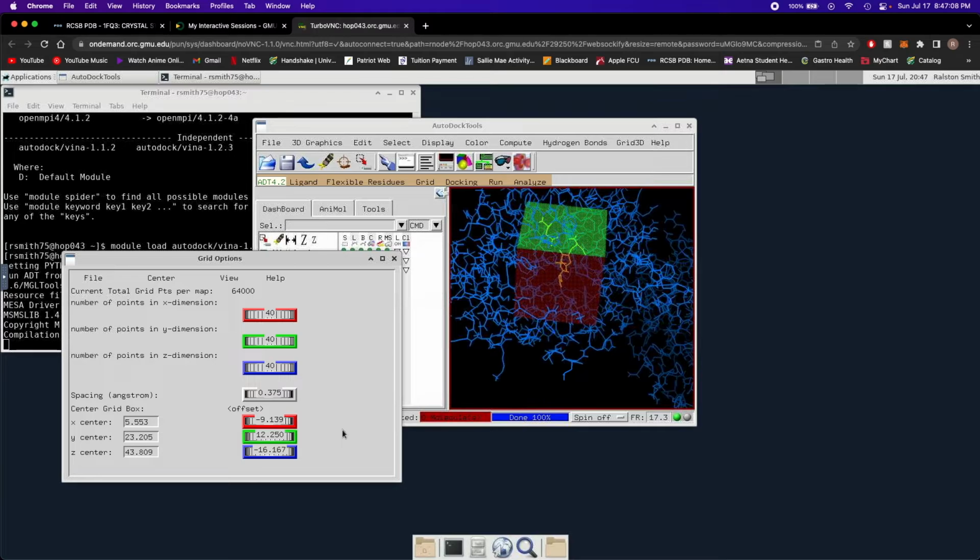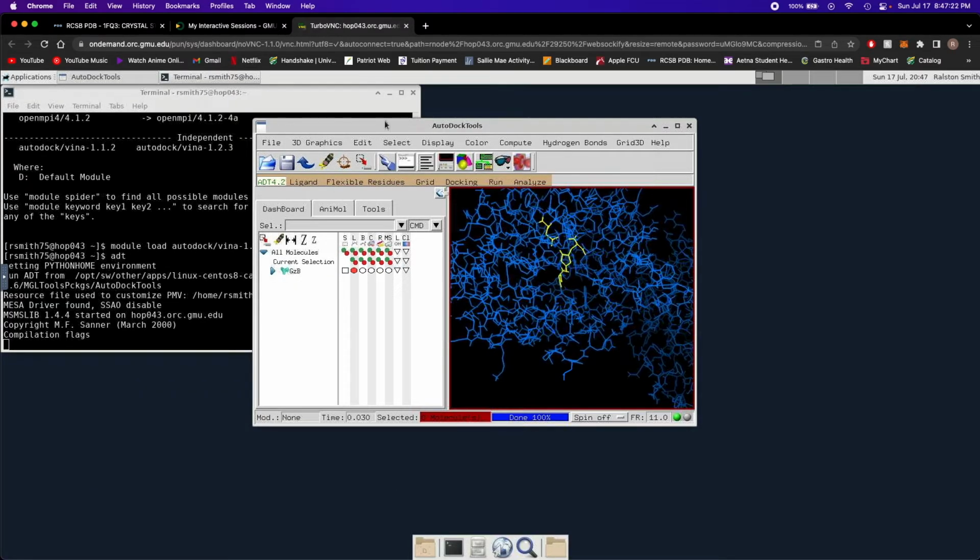So I normally just take a picture of it with my cell phone, and then I have that information for use later. And then we can close this, and we're done with this step.